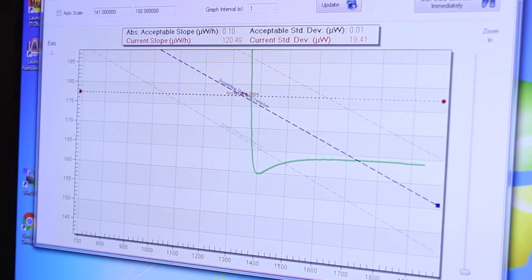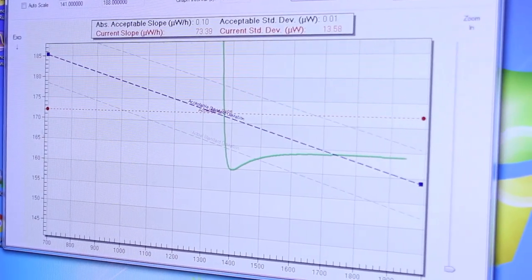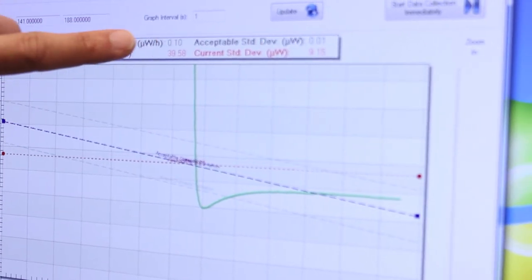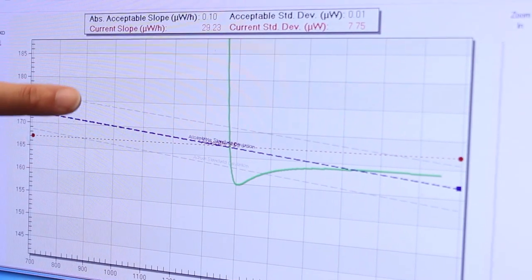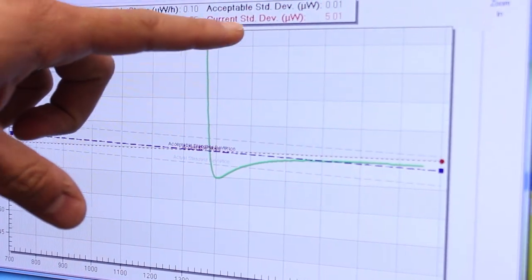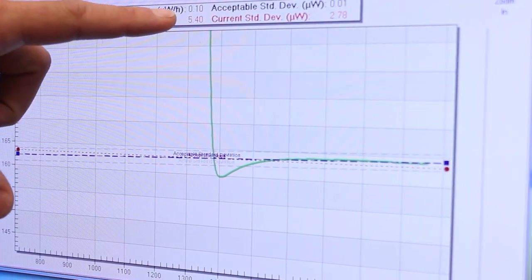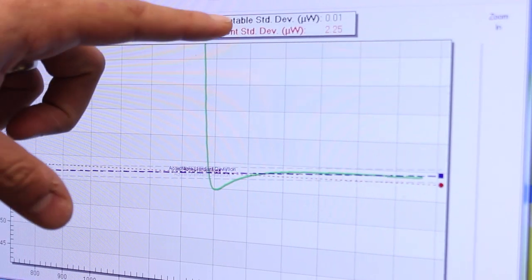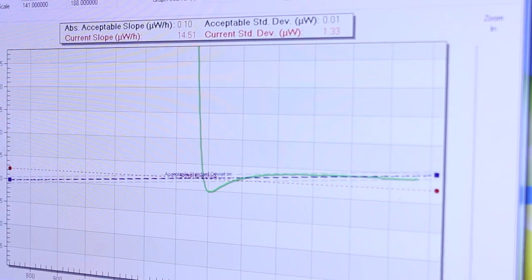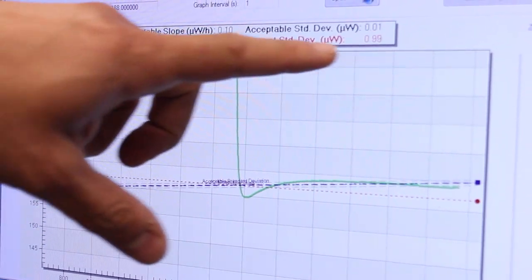Okay now it has collected enough statistics that the auto equilibration procedure has actually started. What you see on here either printed on the top of the graph or shown graphically on the graph itself are the current slope of the baseline and the current standard deviation of the baseline as well as the acceptable slope based on the amount of heat that you expect and the acceptable standard deviation again based on the amount of heat that you expect. We can currently see that the current slope is much much larger than the acceptable slope.